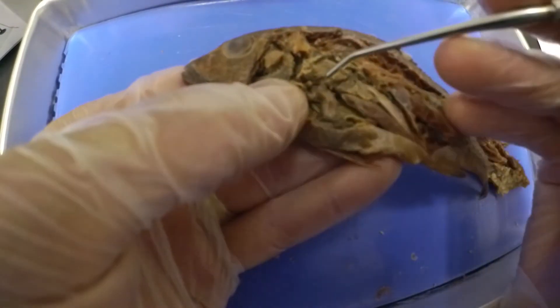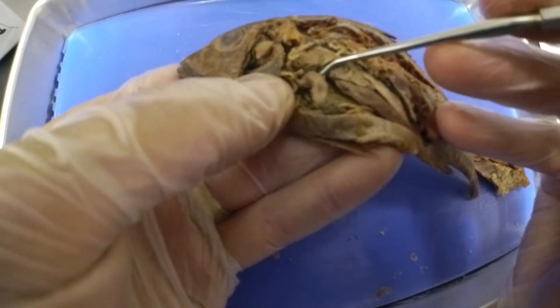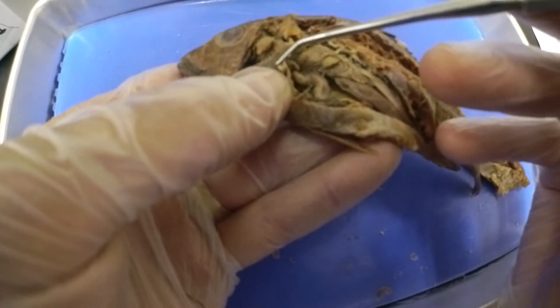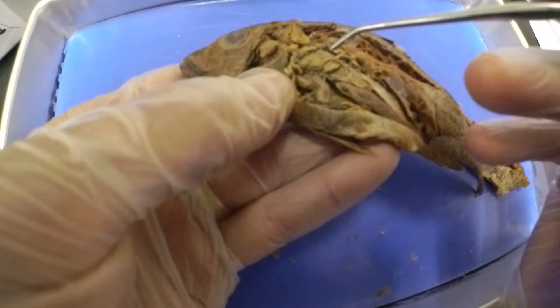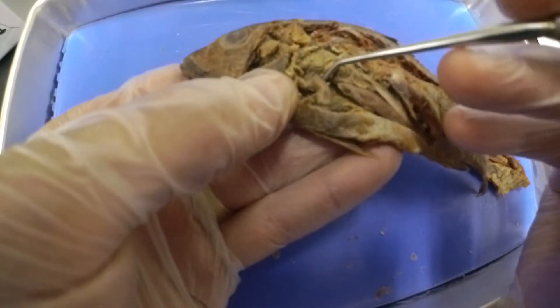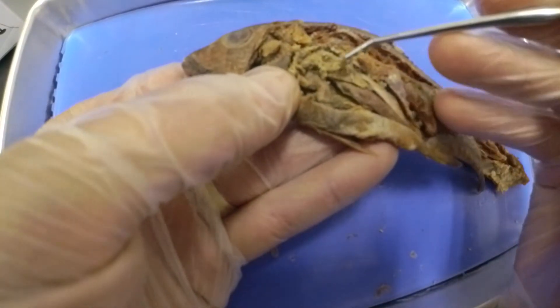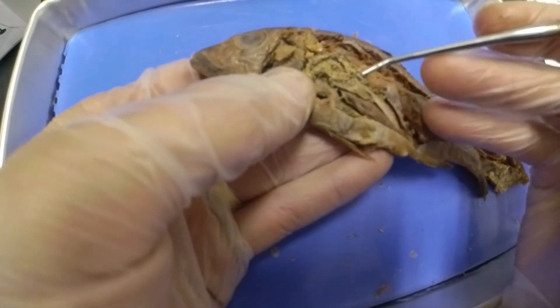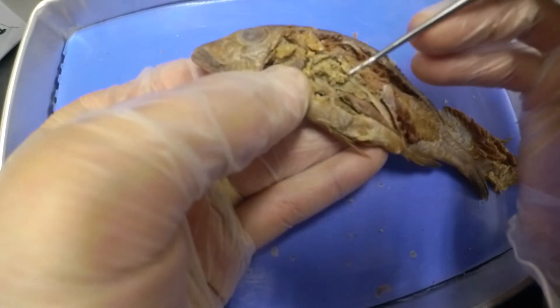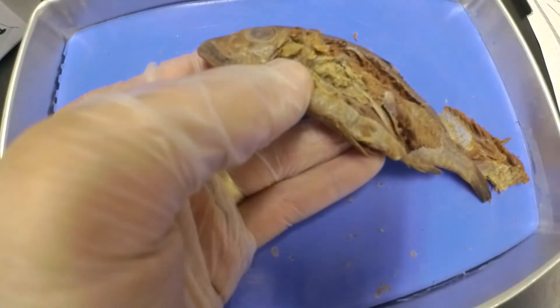Remember, fish only have a two-chambered heart. Blood goes through the gills, gets circulated through the body, and comes back into the heart. The atrium is on top and the ventricle is on the bottom. When blood comes back, it's stored in the atrium and then gets pumped out to the gills. So that's our heart.